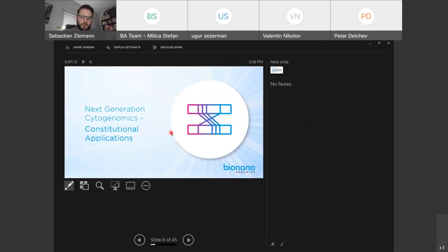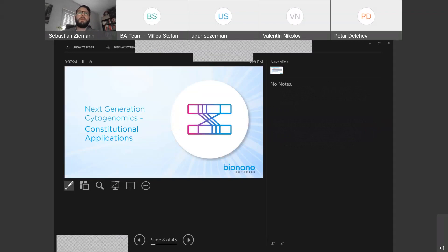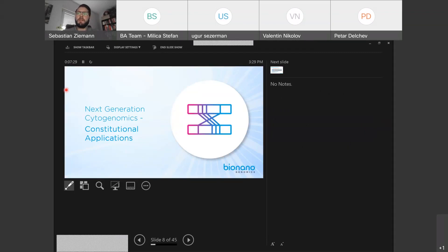I'm going to show you in the software what such a typical result would look like. I hope you can see my screen. This is a typical view when you have analyzed your optical genome mapping data. You will get a nice overview of the genome in a circles plot, with all chromosomes 1 to 22 and X and Y, and the cytogenetic bands.